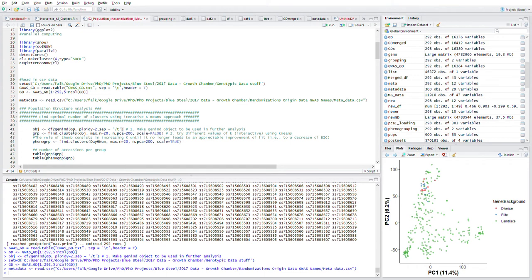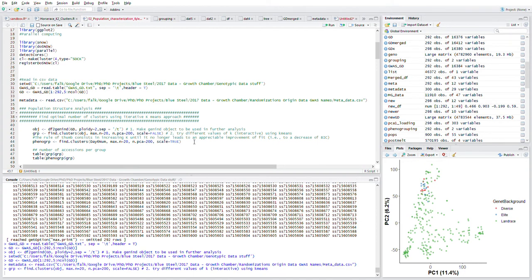This function essentially just makes it a genind object to be used later in the process. Once we've created this object, we use the find clusters to iterate through the object using the k-means approach.